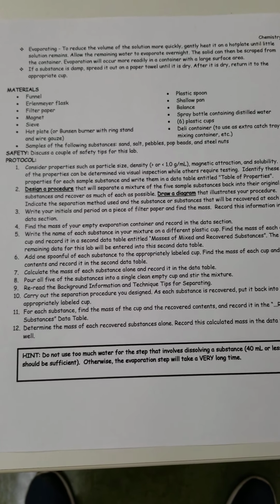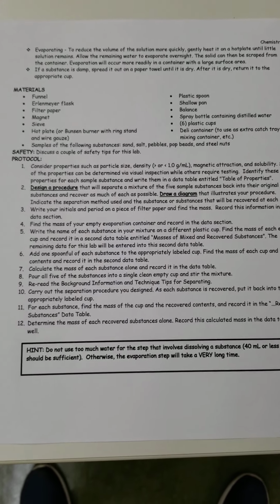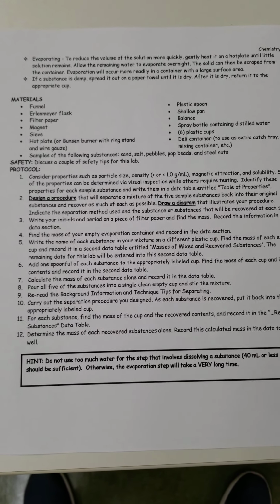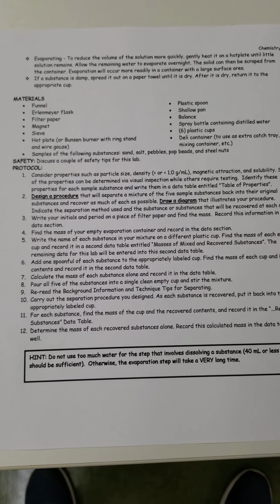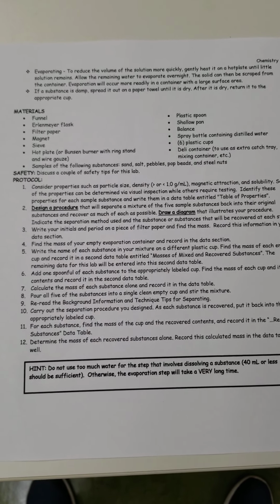But with the restrictions that we have, I'll go through all of the pre-measurement and then give you a chance to plan what you think you would have done if you had the chance to do this lab. And then I'll go through what we think is the best approach to separating these mixtures.